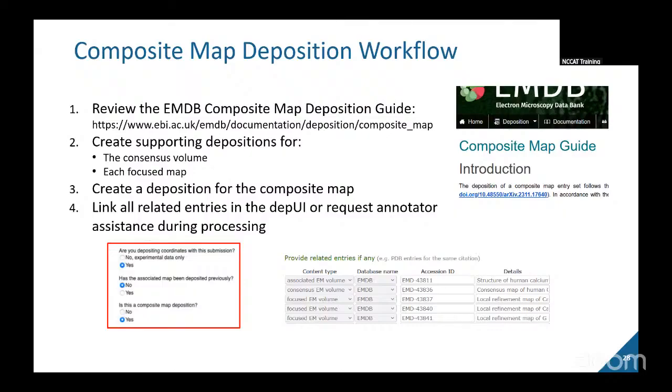That summary slide you showed, which has the projections of each of those related maps, is already helpful, because you can look at that and say, oh, right, that's that one, that's that one. I feel like we should have something more graphical baked into the interface, where we have Molstar, but imagine you just turn everything on and then see it all appear and link different ones. Yeah, it's a good point.